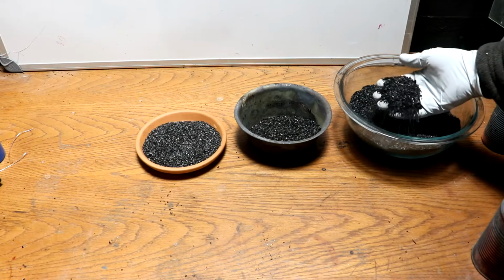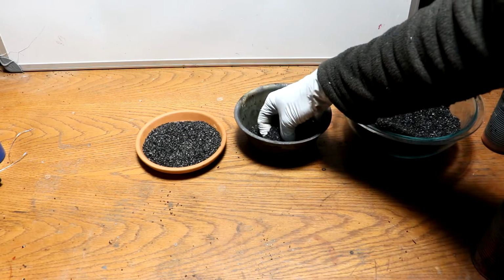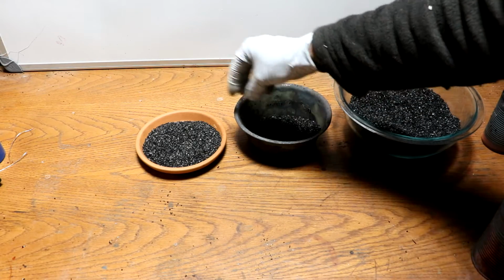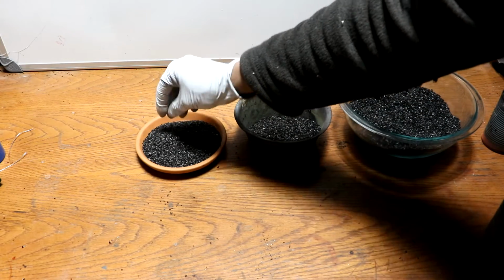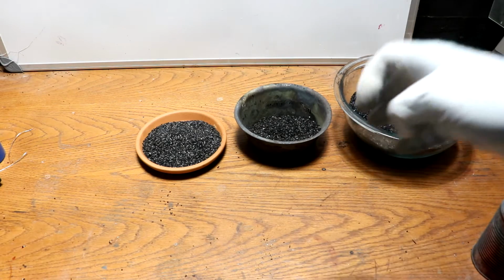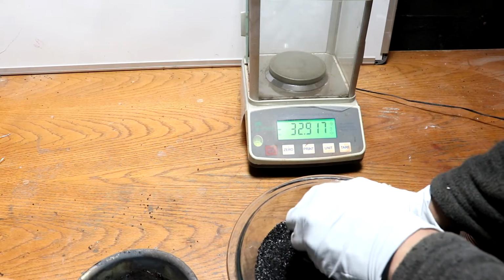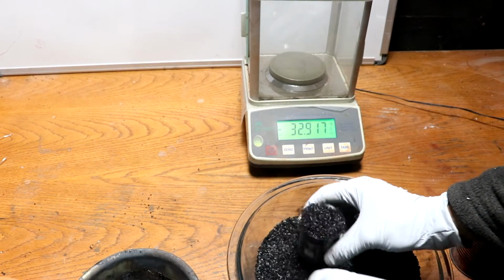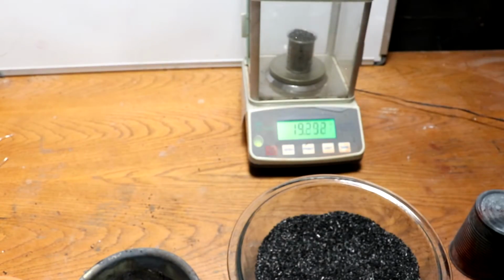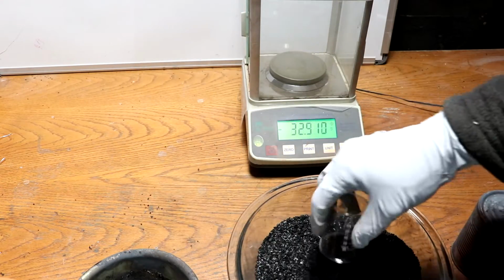Now, from just playing with this a little bit, I've noticed that the stuff that I ran the steam through feels slightly denser than the other charcoals. So let's pull out my scale and let's actually have a look at that. Little beaker here. Let's just fill it up with the control to the top so it just kind of shakes off. 19.3 grams. Dump it back out.